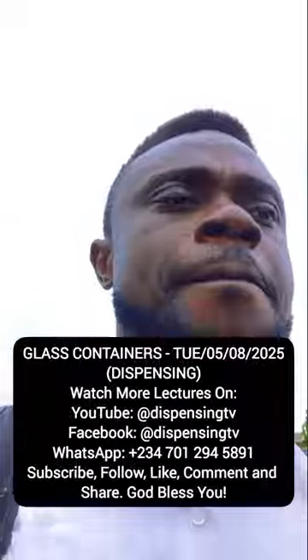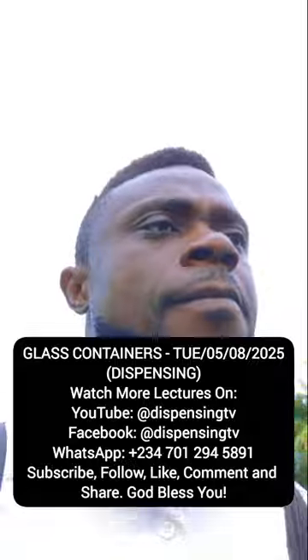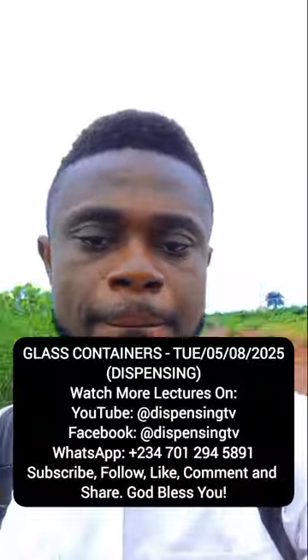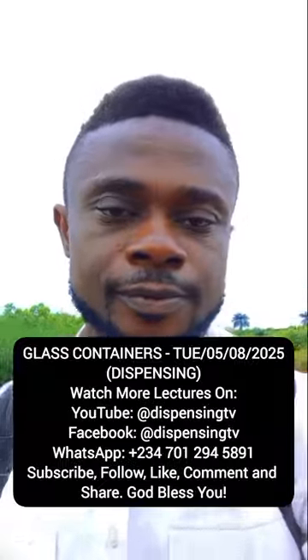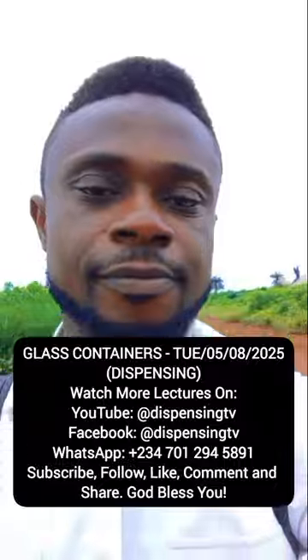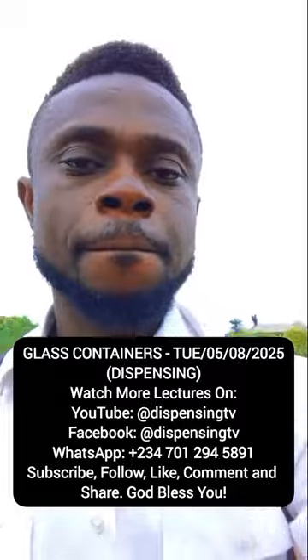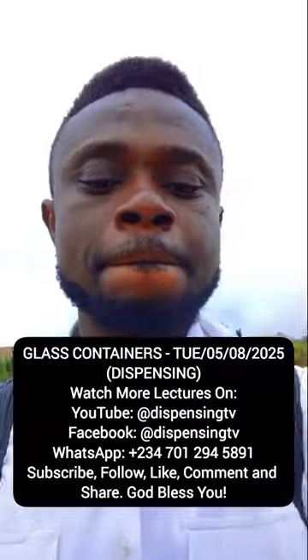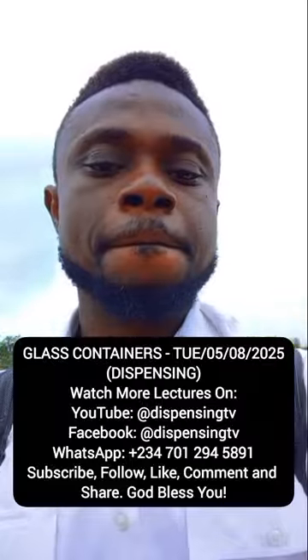We have glass dropper bottles. You've seen in our last class we talked about the calibration of the dropper, when I drew the dropper and the glass, right? The other one you see is Knock Off, and you also see paracetamol drops. The bottle itself is there, then the dropper, so the glass dropper bottles.